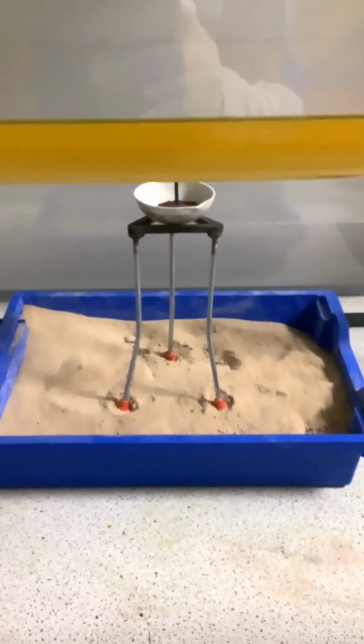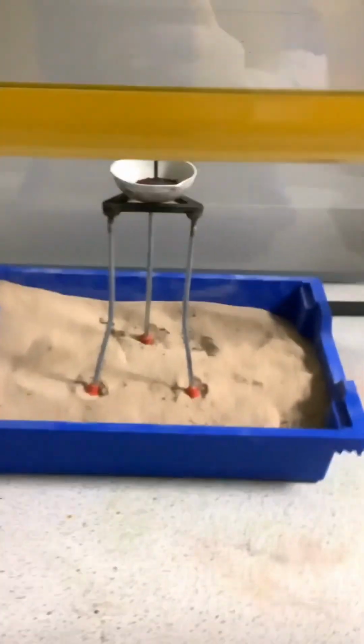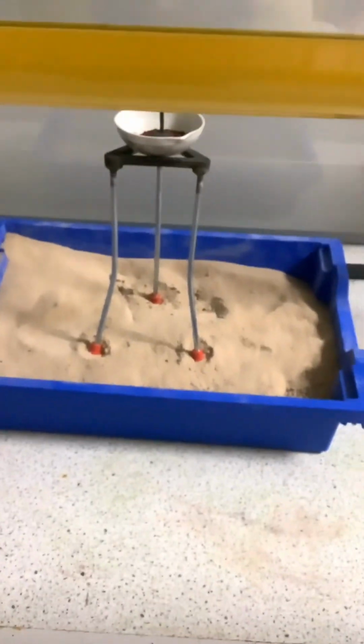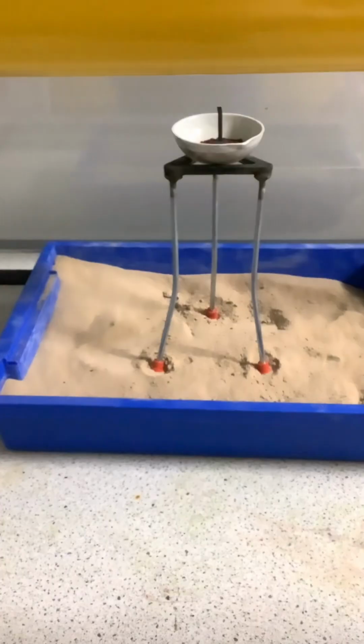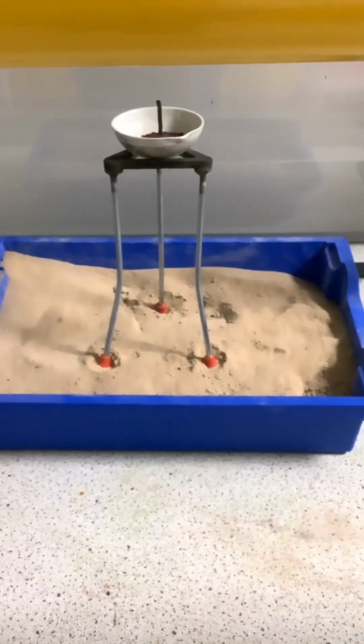Right, as you can see over here, this is a fume cupboard, and we have to carry out this experiment in a fume cupboard due to health and safety reasons and the fumes coming out, including the flames. I have just improvised a bit by adding a tray in here, and the tray has sand, no water in that.